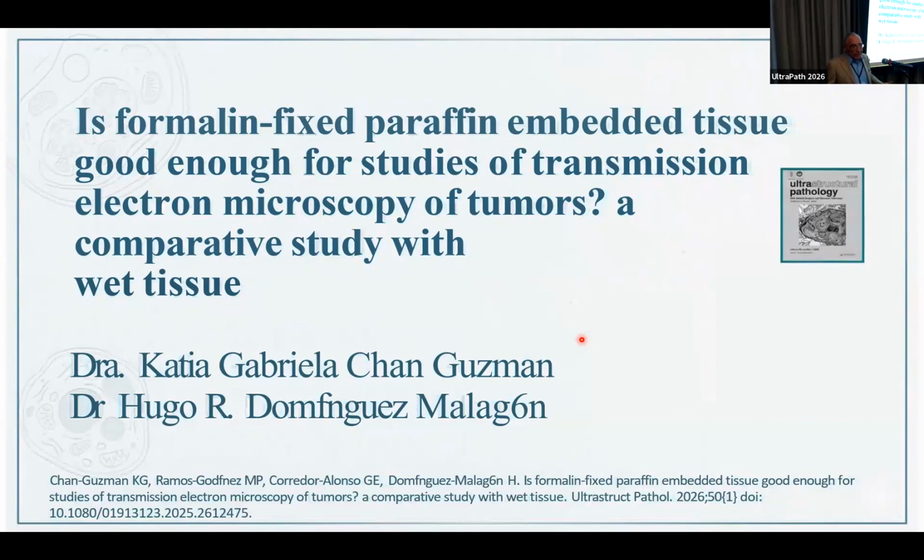So we gathered a series of cases and compared the wet tissue, the formalin fixed tissue, with glutaraldehyde tissue. So these are the results of our research in Mexico. So I'm going to leave the microphone to Dr. Katia Chan.